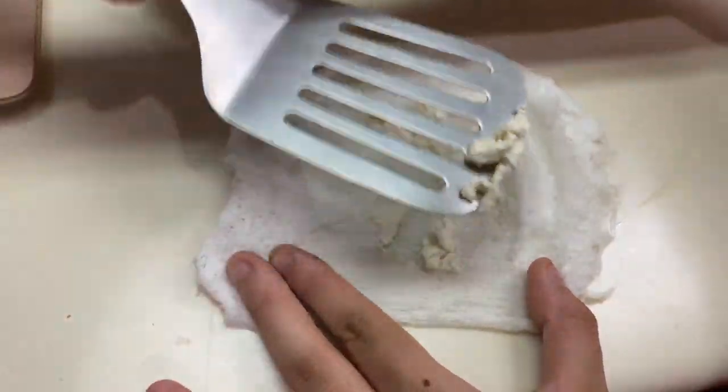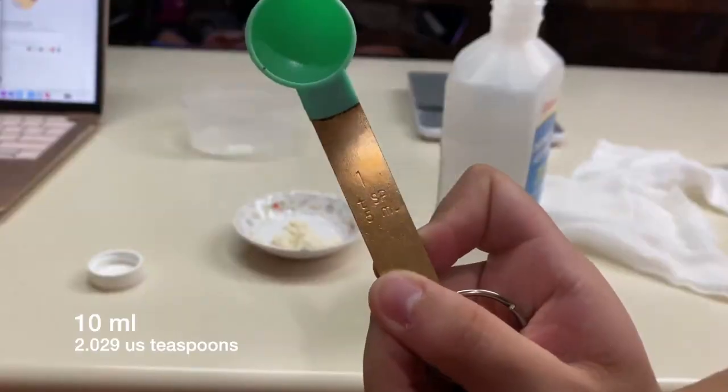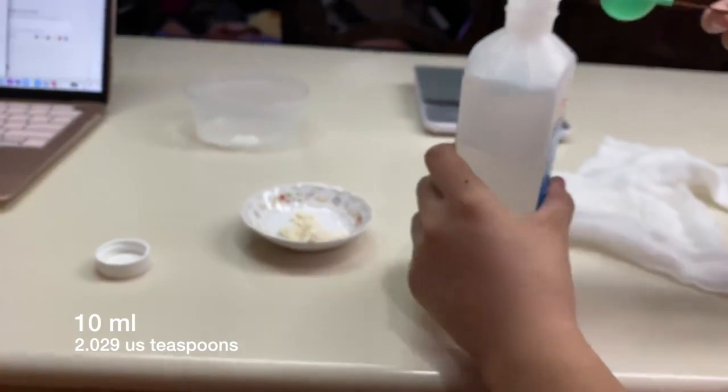Using a spatula, scrape the precipitate from the cheesecloth into a clean container. Add 10 milliliters of ethanol to the beaker.